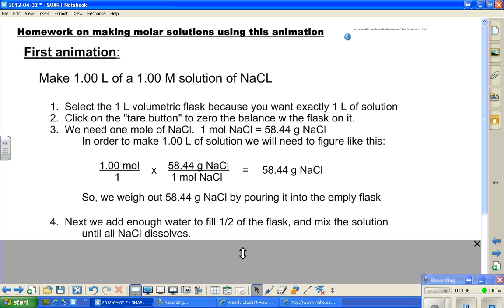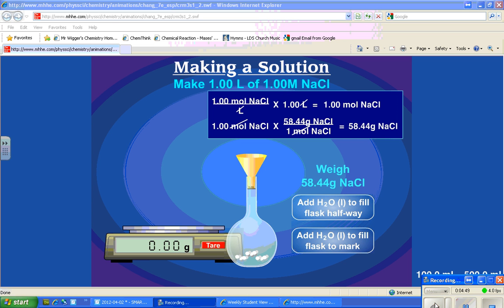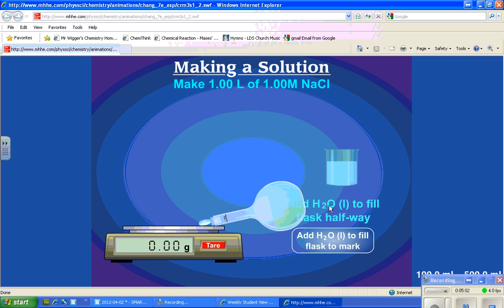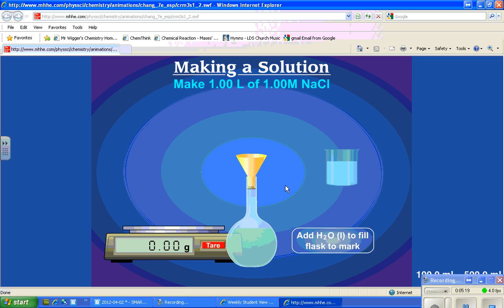Next, we're going to add enough water to fill one half of the flask, and not all the way, because we still need to be able to mix the salt in after the water is put in. So we pour that in using a funnel, and pour it up about half-way, and then we are going to be able to get it all mixed up. Usually I just swish it by grabbing the neck of the flask. As we swish it around, it will dissolve that solute into the solution.